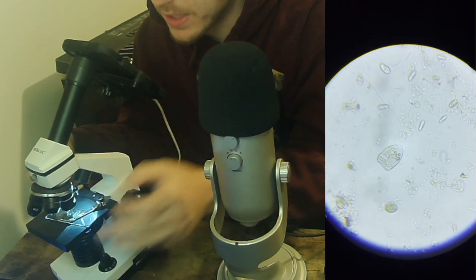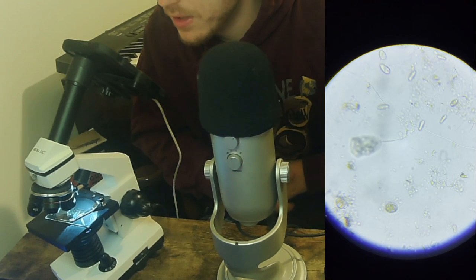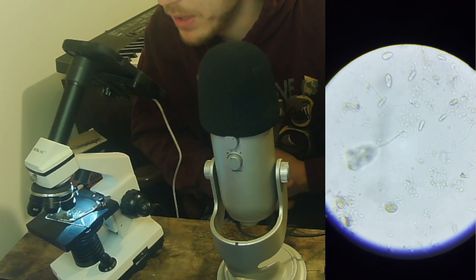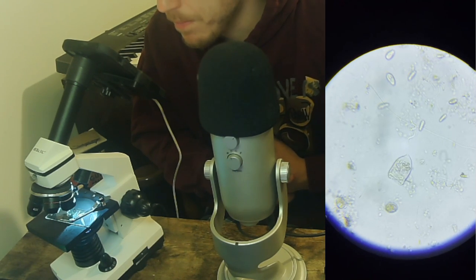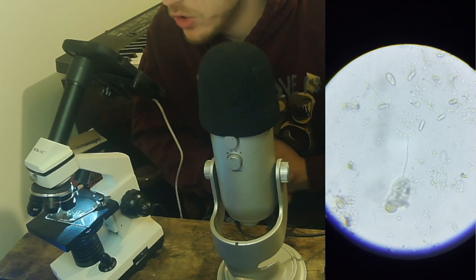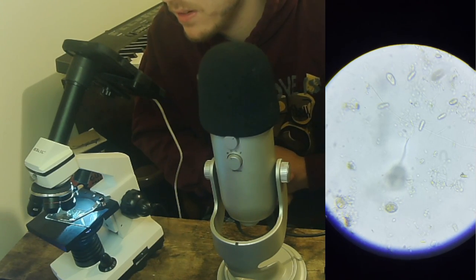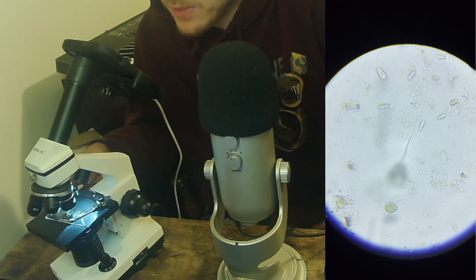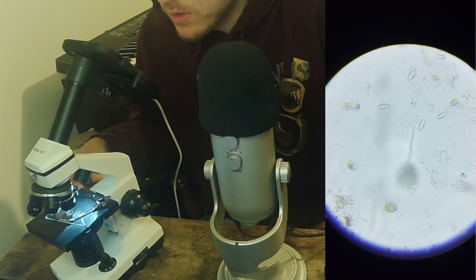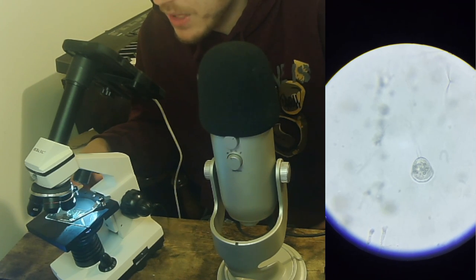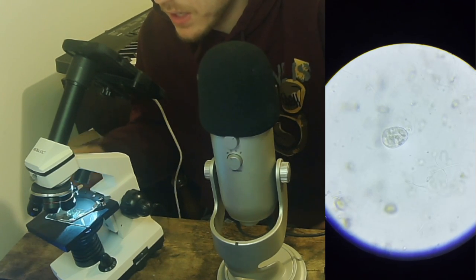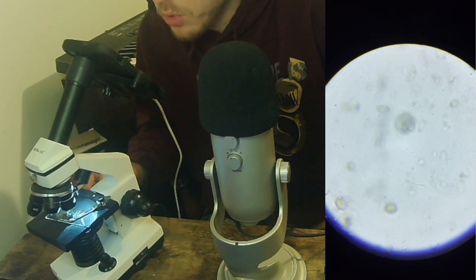So this guy, as you can see, has a little spiral thing that's holding him in place and he'll reach out trying to grab something and then sort of snap right back into place in an instant. It's so fast you can't even see it. He's clearly going at different depths because you'll see he's at a higher depth right now but then when he snaps back, now he's out of focus. You got to refocus him. Really cool.